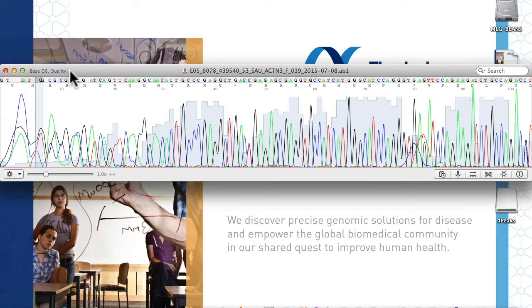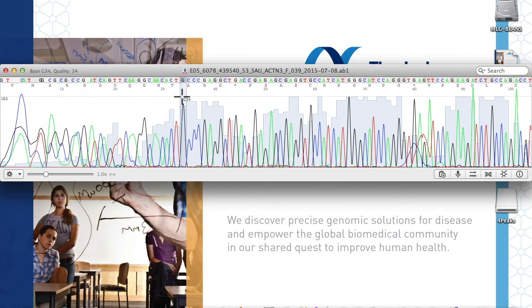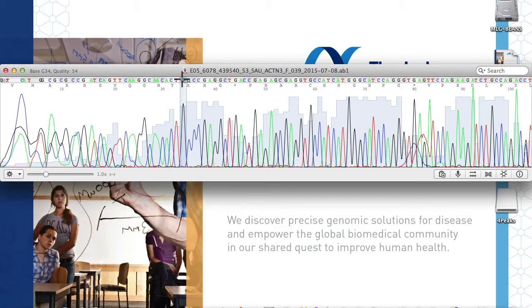If you want to open another file, you can see what good quality traces are supposed to look like. Distinct, steep, and smooth single-line peaks. The base call at the top of the window should reflect the color of the trace below it. However, there is almost always poor quality sequence at the beginning and end of even good quality reads.